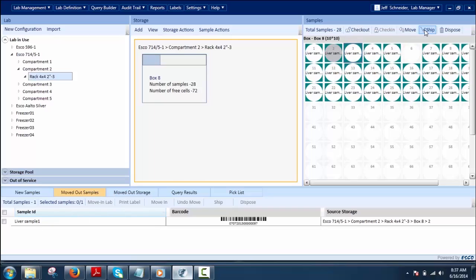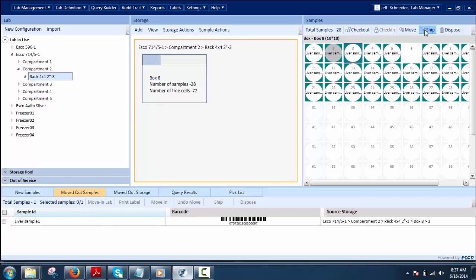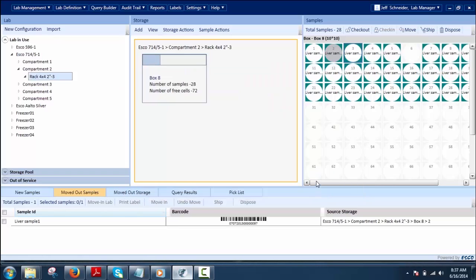Ship allows the user to send samples from the lab to other places for testing or other purposes by using the Ship option. This can be done on single or multiple sample selections.